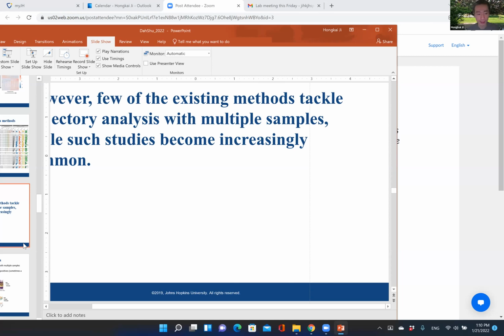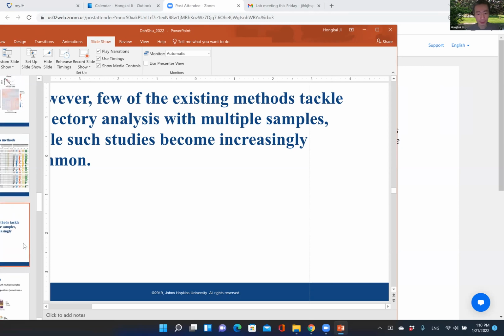Again, the most time-consuming step is the integration step, as well as some of the curve fitting step. But in general, it's much more efficient and definitely doable for, I think, most people.